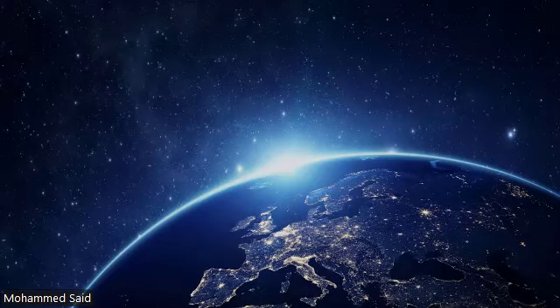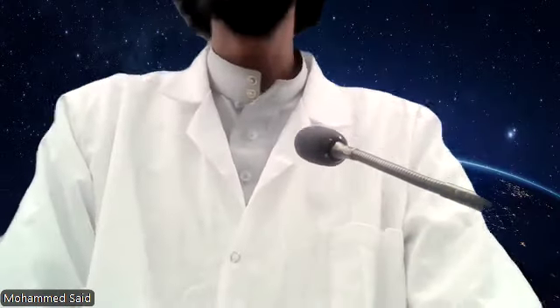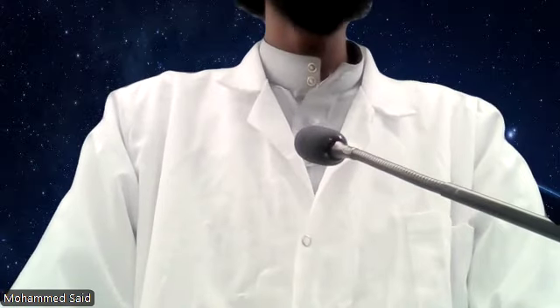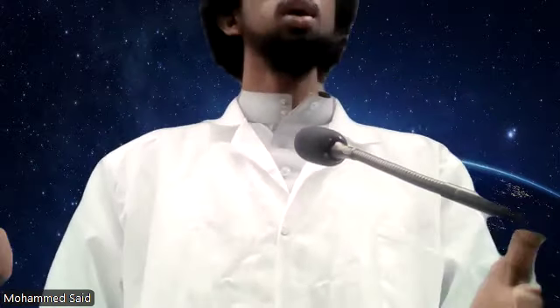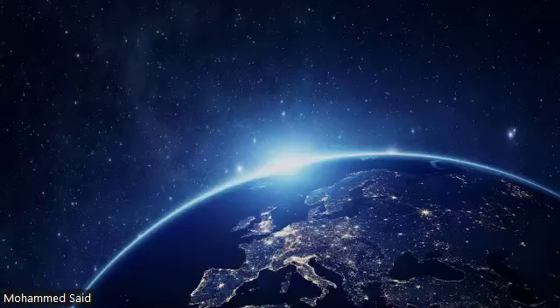Oh yes, perfect. For those wondering about the results for the post lab for lab 5, you can have a look there. Let me clarify some updates. Staphylococcus epidermidis and E. coli, even though grown for roughly 24 hours, have different turbidities, as you can see if I look the plot up.